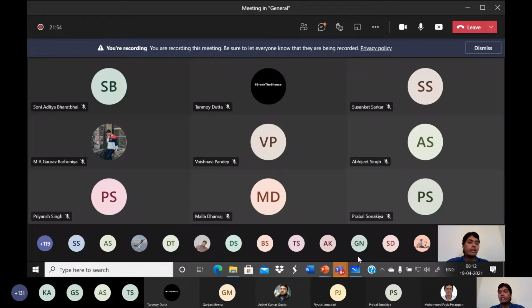The sequence difference between me and someone else is very little, because both are human. So there are some kinds of primers, and I will come into that again in more detail. But our goal is to just amplify DNA. At this position, you don't need to consider which portion of the DNA we want to amplify. After explaining the mechanism, you will get it.